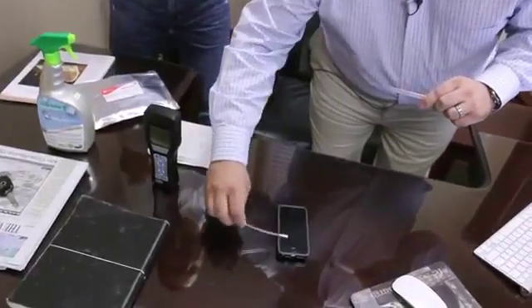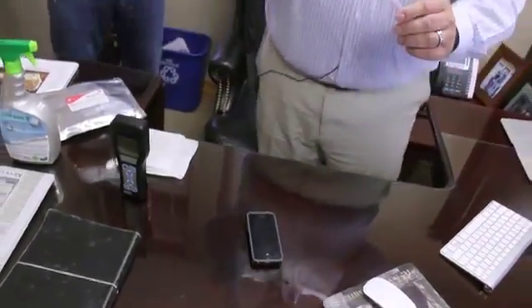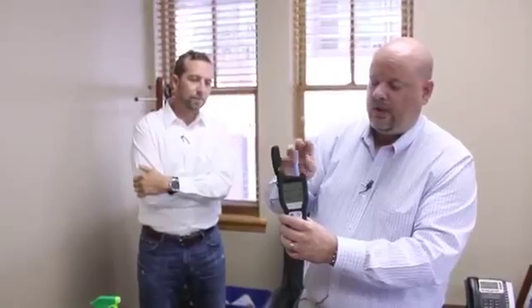So what we're going to do is take Joe's cell phone, pull our swab out, and rub the swab back and forth, spinning it in our hand to make sure we get complete coverage all over the swab. We're going to put it back into the holder, crack our tip, squirt our liquid into the bottom of the tube, shake it for 3 to 5 seconds, and then put it into our meter. And in 15 seconds, we'll know exactly what the bioburden on that surface is. So the reading on the surface of Joe's cell phone is 3,589.